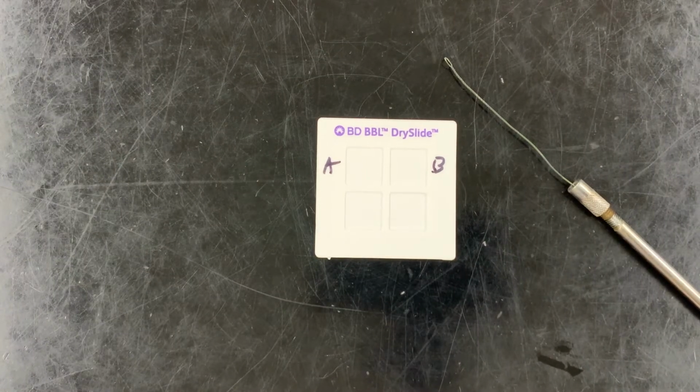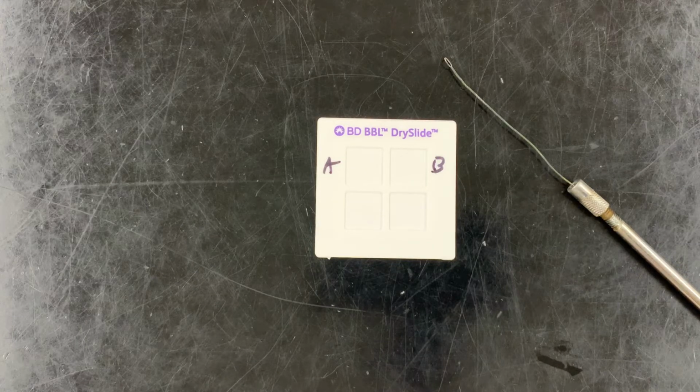The oxidase test is a presumptive test used to determine whether a gram-negative rod-shaped bacterium belongs in the family Enterobacteriaceae or non-Enterobacteriaceae. Now, under the microscope, these two look very similar, gram-negative rods. And a gram-negative enteric or Enterobacteriaceae is actually quite different from a gram-negative non-Enterobacteriaceae or non-enteric. Right? Two very large families, and even within those families, there are hundreds of bacteria.